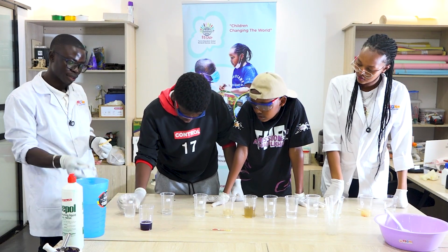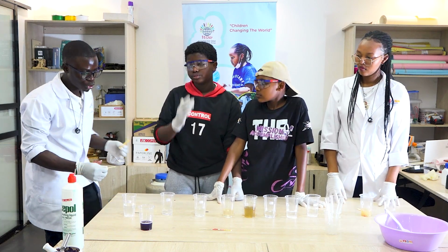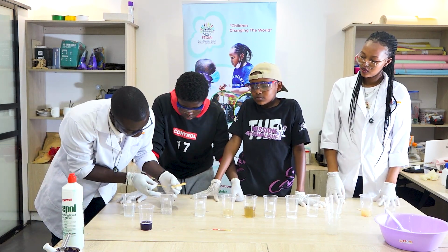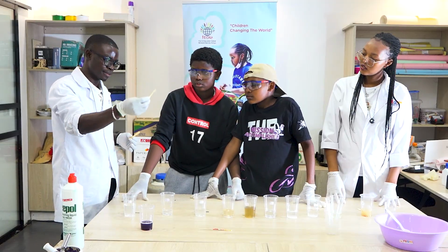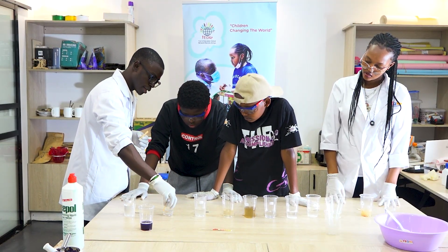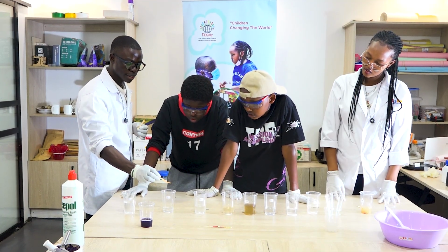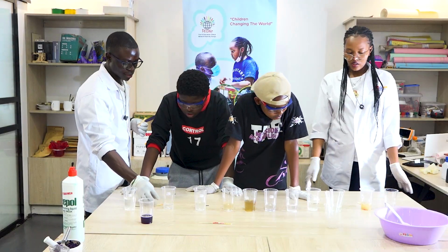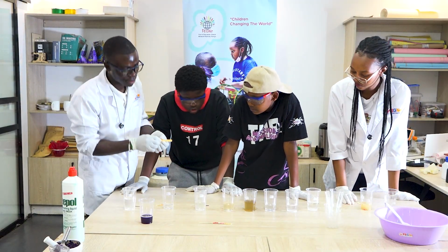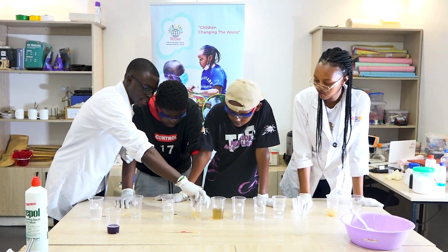Bicarbonate, sodium bicarbonate. Now again, we are going to do one on hydrogen peroxide. So let me try. Then I just dip it down right there. Then what's the color when I remove it out? So it's a shade of red, right? It's a shade of red. Good. Then which one next? We go for this one. Starch solution. So we're going to try that and see. Just dip it inside there.